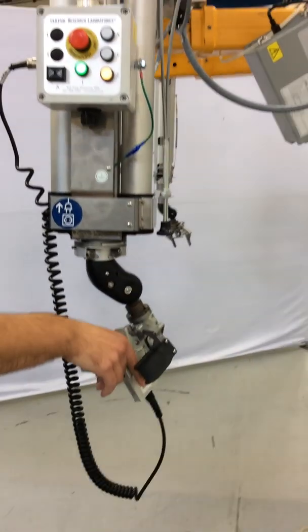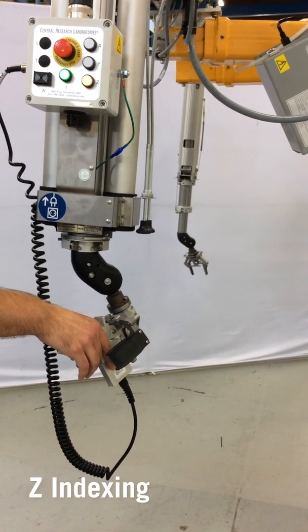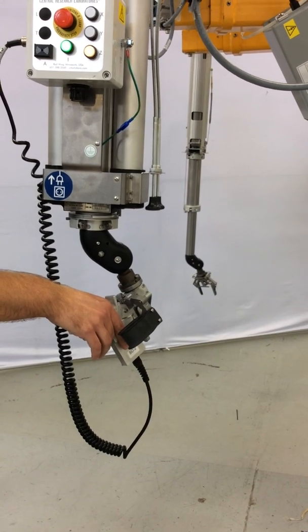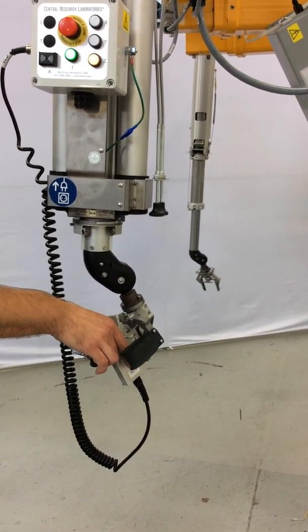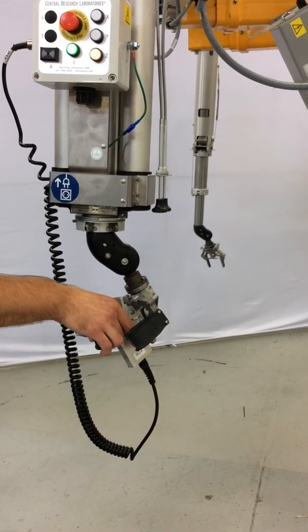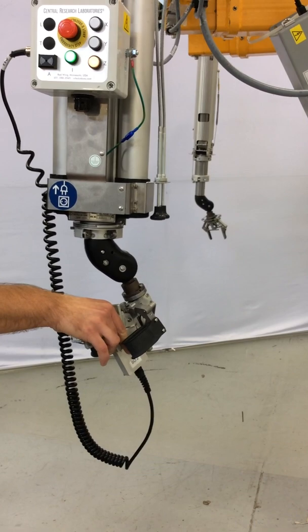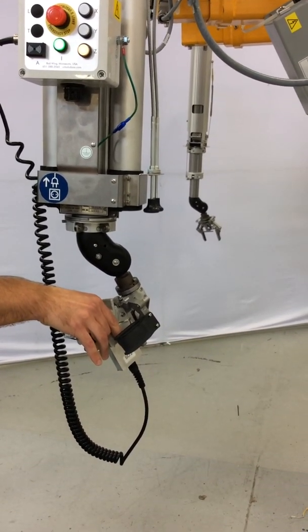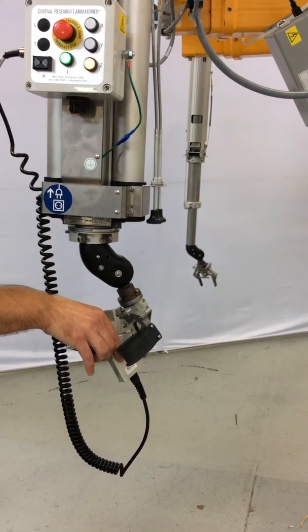For the extension or Z indexing, if you push forward it lowers the manipulator. You pull back on the trigger and it will raise the tong in relation to the handle position. There is also a potentiometer on the bottom of the operator control panel which can adjust the speeds of the indexing.